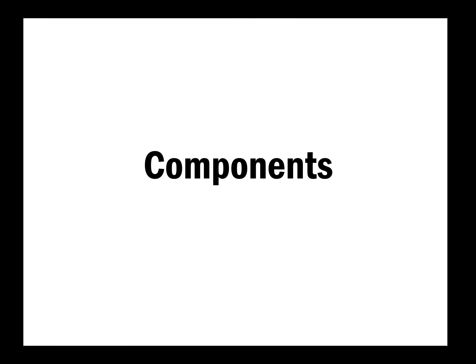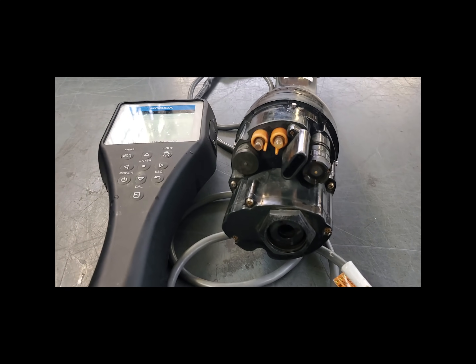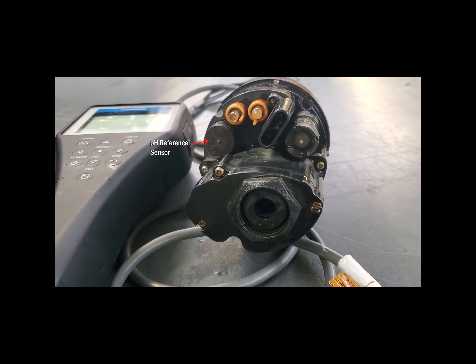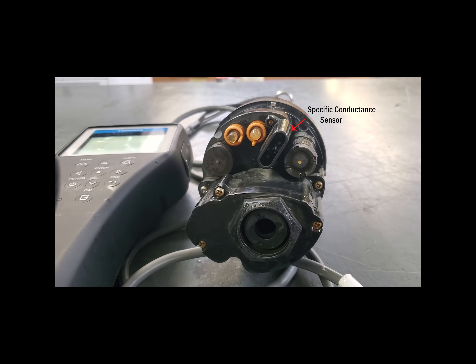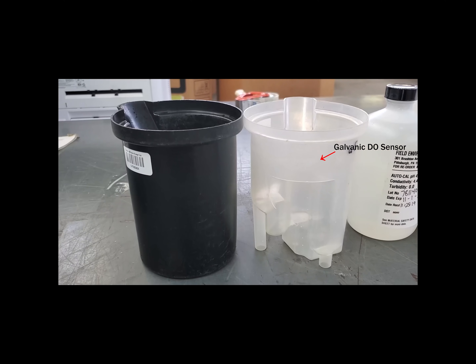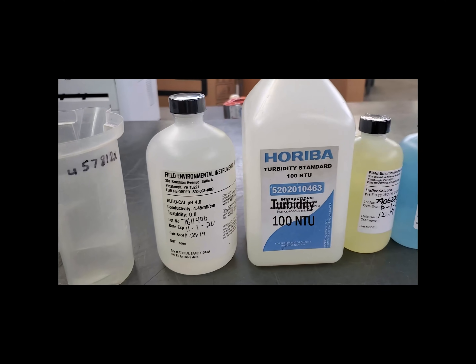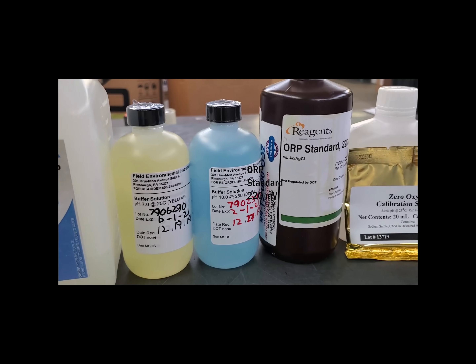First, we'll be discussing the components of this instrument. We have the handheld and the sonde. Moving clockwise around the sonde: the turbidity sensor, which is the largest part; the pH reference sensor; the ORP sensor; the pH sensor; the specific conductance sensor; and the galvanic dissolved oxygen sensor. For this calibration, you'll need storage and calibration cups, auto-cal solution, turbidity 100 NTU, pH buffers 7 and 10, ORP standard, and DO solution.